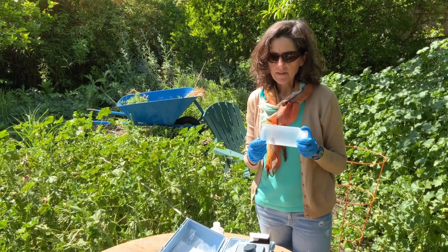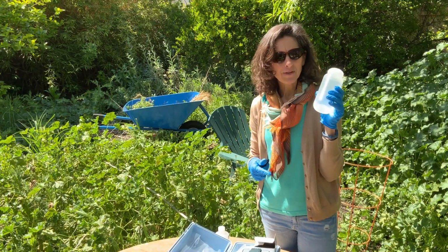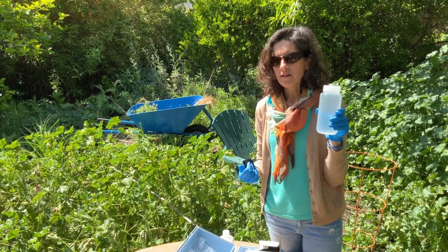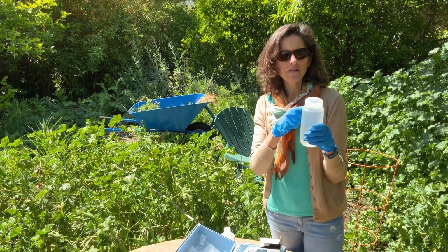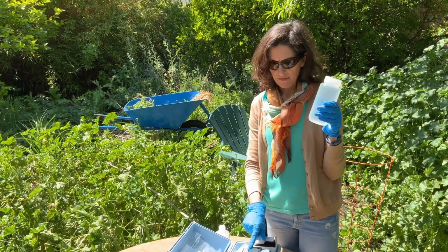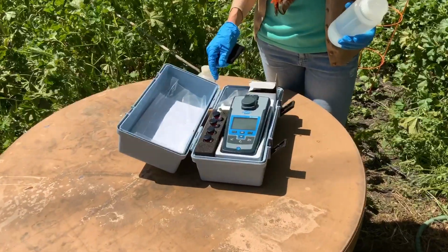And so I was thinking that I've waited actually a week or 2 weeks now in between, and if it was just mineral particles that were suspended in it, it wouldn't matter that I waited, but it might have grown algae in the meantime. Algae can contribute to the suspended particles, so it's generally a good idea to do it out in the field right when you take it, if you have a field turbidimeter like we have. So this is our turbidimeter. It's a little Hach kit one.